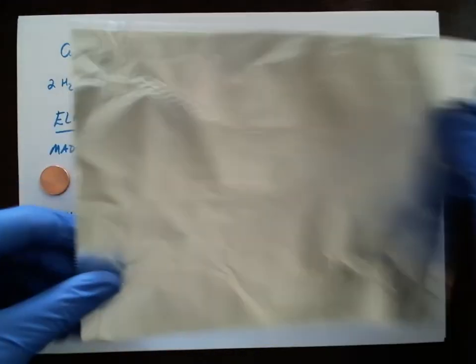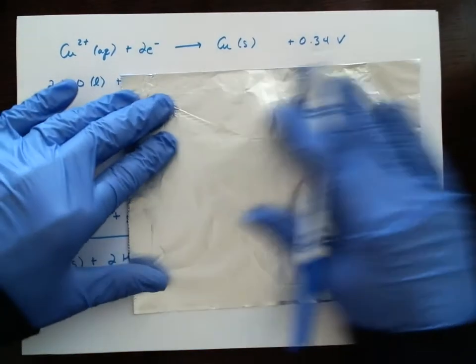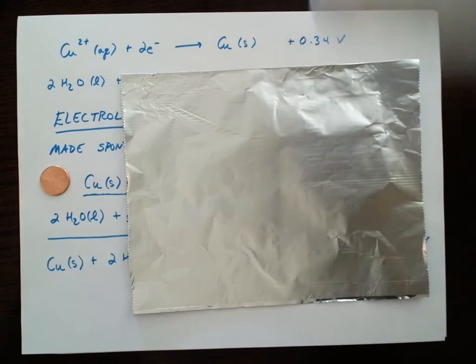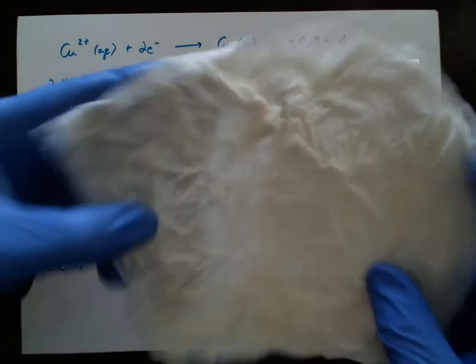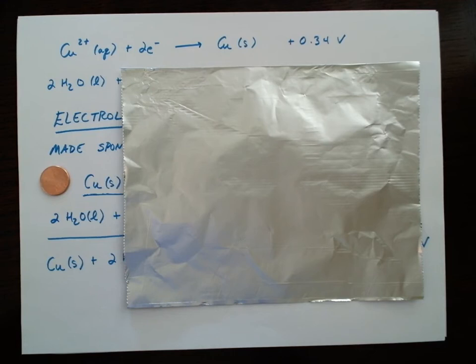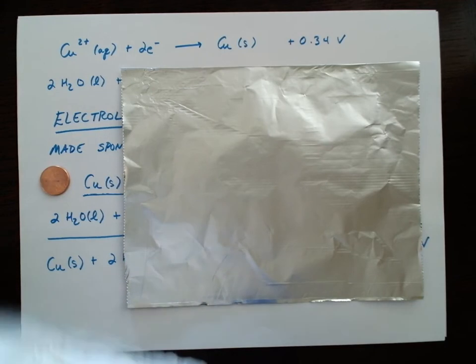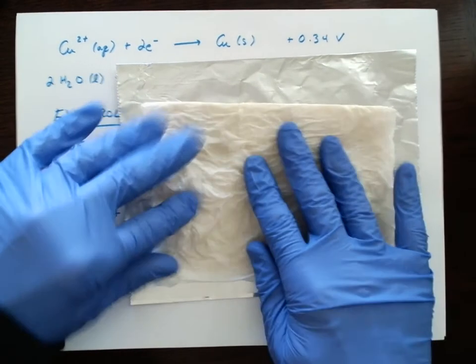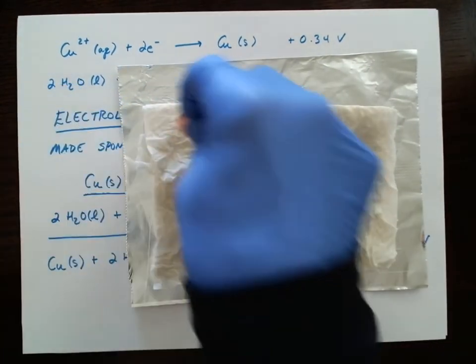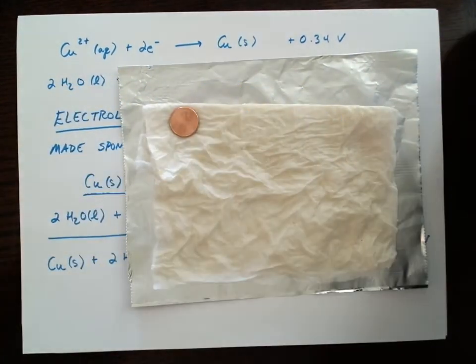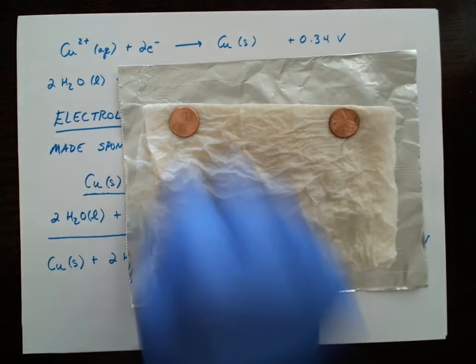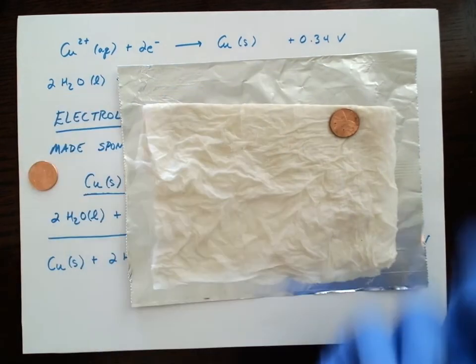So I'm going to take some aluminum foil here, and I'll take this paper towel that's been soaked in water and some ammonia. Some water and some ammonia, and it's also been soaked in some salt. And if I just allow this to sort of set on the surface like that, pull it over, and nothing happens.